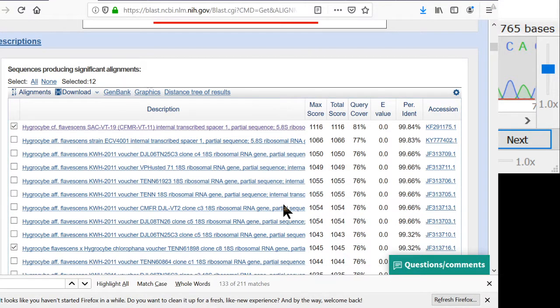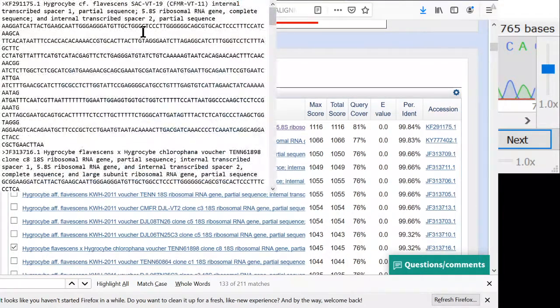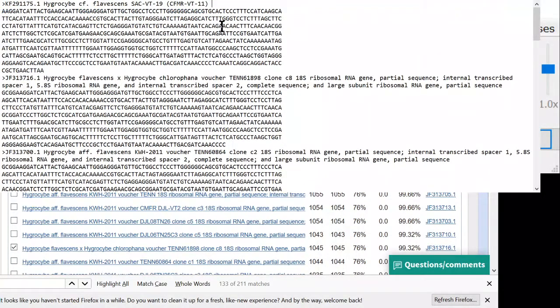And we will open it with Notepad. And I've got to go over here, and we have the Notepad shared. Okay, cool. So here's the FASTA. And you can see that when you get a FASTA from GenBank, it's got a really long name in here, and a lot of the stuff isn't needed. You can trim out the name of the gene because we know this is all the same gene anyway.